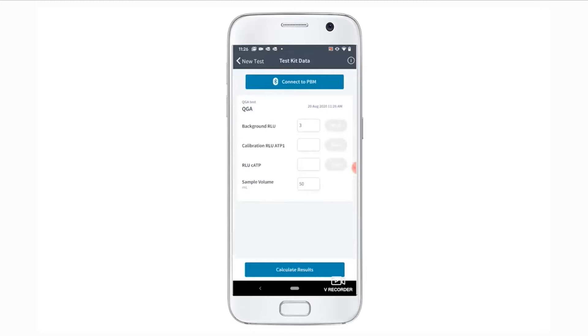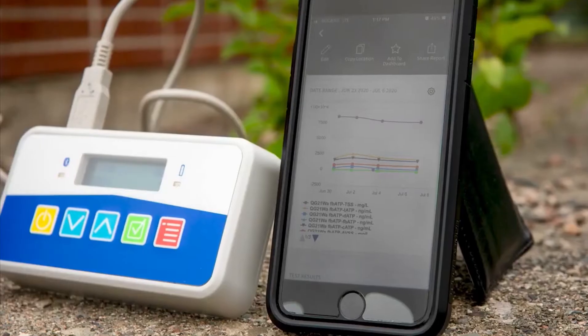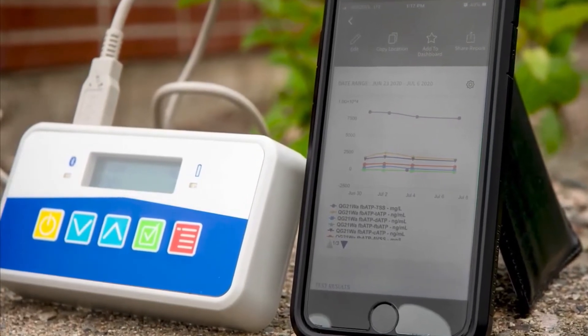On the Test Kit data screen, you will see a Connect to PBM button and several text boxes with greyed-out Read buttons, indicating that they are disabled. Now, connect your mobile device to the PBM device using Bluetooth with the following steps.